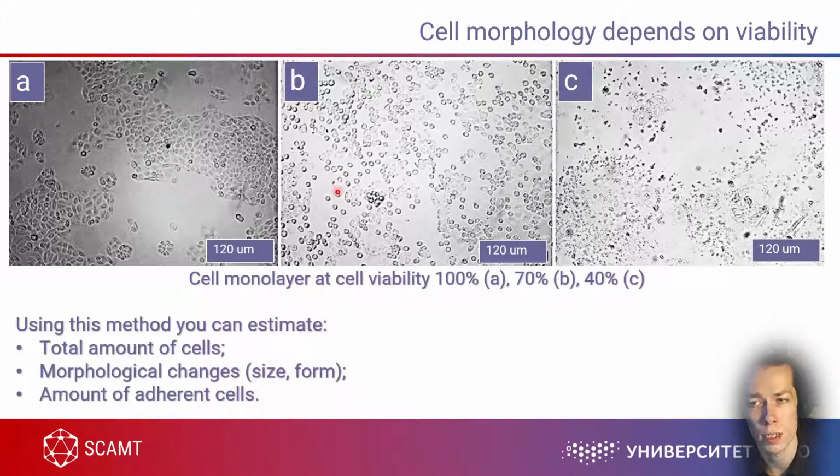So they lost this connection, but observation of these morphological changes alone cannot give you an answer why this happens. Why did these cells lose this connection? Because of damage done to, for example, the cytoskeleton, because of depletion of ATP, because of direct damage to the collagen fibers which hold the cells in place. You cannot answer this question.